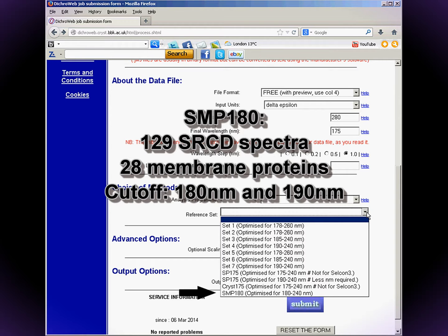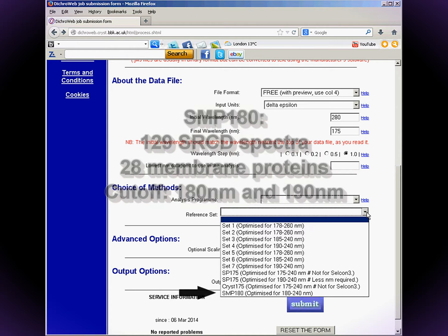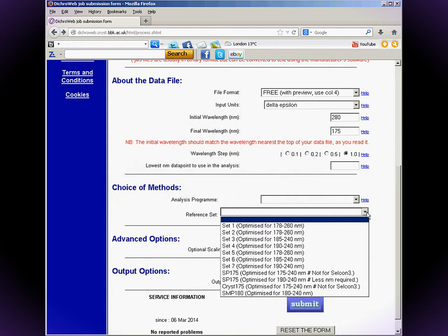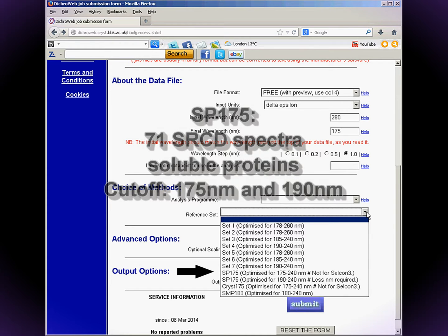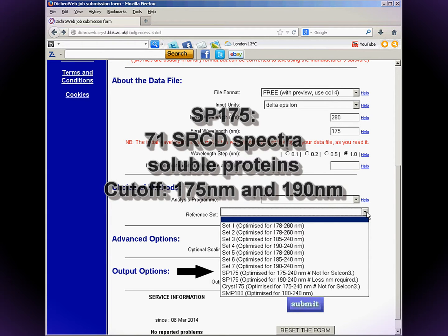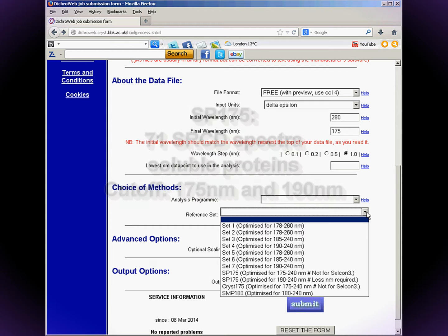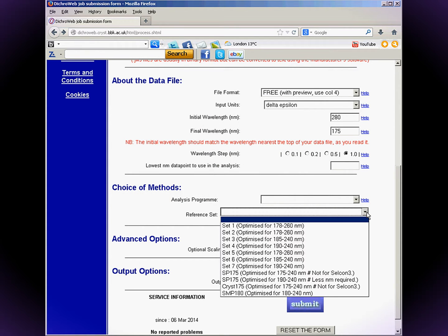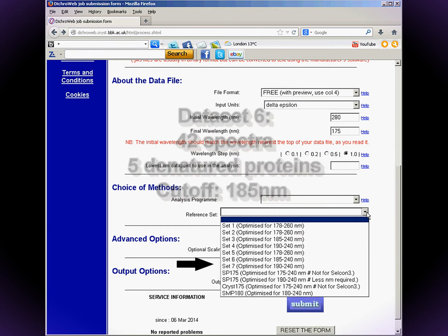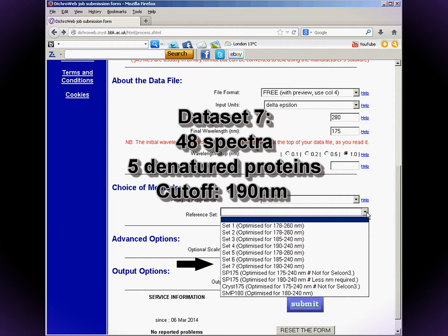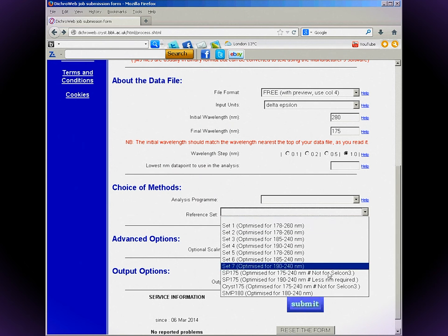There are two versions of SMP180: one with a cutoff of 180 nanometers and one that cuts off at 190, although the latter is not available at the time of filming. If you've got SRCD data that's good to 175 nanometers or below, you could use SP175, which contains 71 SRCD spectra extending to 175 nanometers. If your spectrum indicates that the protein contains a large amount of disorder, data sets six and seven are the best choices, as both contain some spectra of denatured proteins.